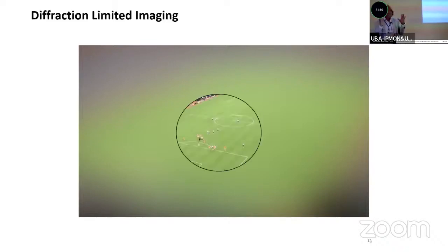That's what you would see. Nothing. You're lucky if you can tell that it's a football stadium there. But there's no way to tell that there are 2 teams there, that they are playing, that they are segregated for moments, that they are playing together for moments. No way to tell there is even a ball bouncing around. So we would like to solve that and look inside that limit to start seeing the details of things. And that is what super resolution does.